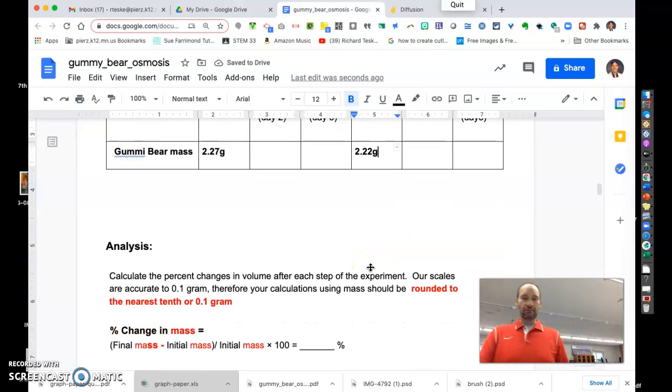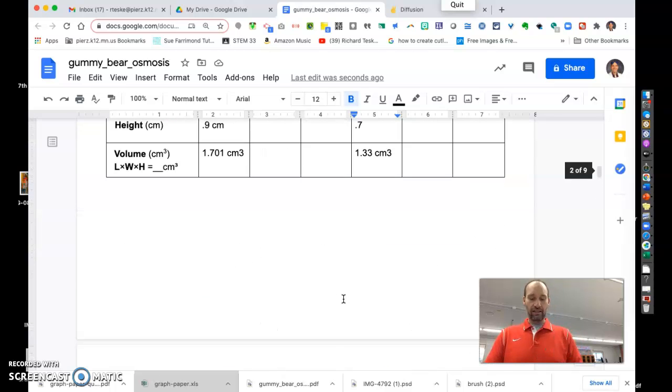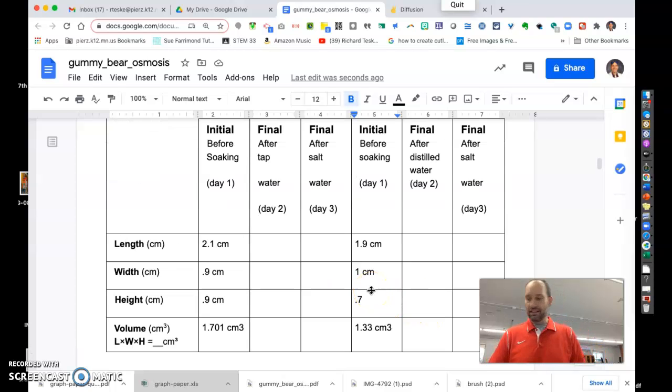Okay. Now, you can't do any of this yet. That's all you can do to this point. And all I'm going to do is I'm going to take the red one, goes into tap water, and the green one goes into distilled. And in 24 hours, when you come back, what do you think will happen? Now, what we're going to do is we'll revisit this on Tuesday and I'll show you parts of it. I'll have some videos made so you can watch them of what happened.